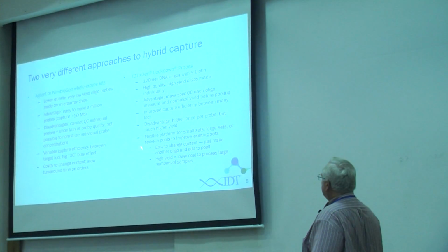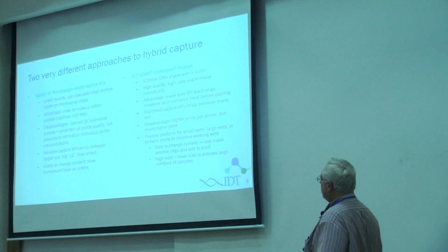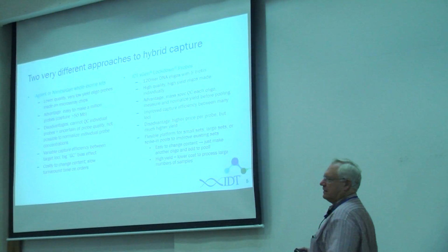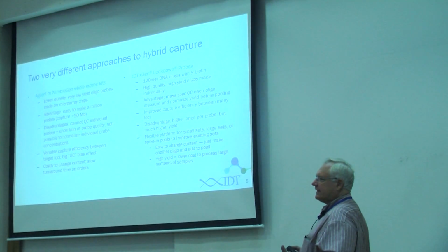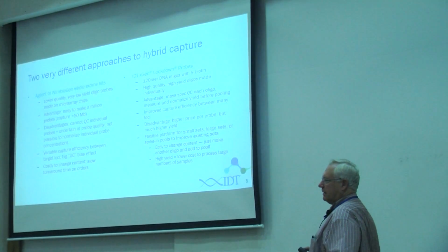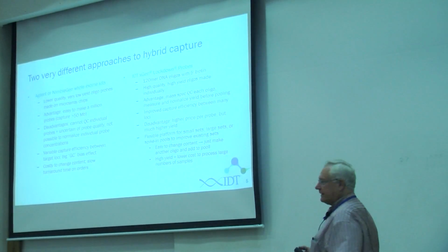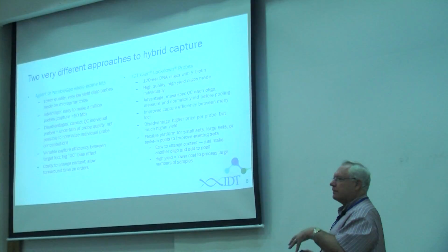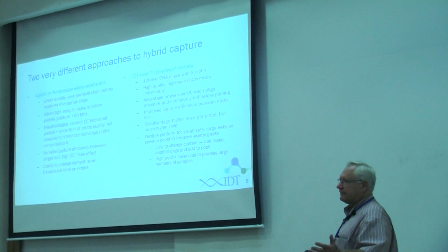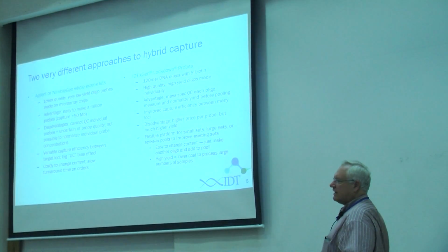But oligos made on arrays aren't as good as the oligos you can make on a single column. And also, the biggest thing is you cannot QC them. You have absolutely no way of knowing if an oligo was successfully synthesized on a chip, or how much was made. And we can tell you by looking at synthesis that's not on a chip, that synthesis sometimes fails. And yields between reactions vary. And so here you're going to have absent probes and probes that may be present at 5 or 10x different concentrations than you desire, and you're never going to know it.